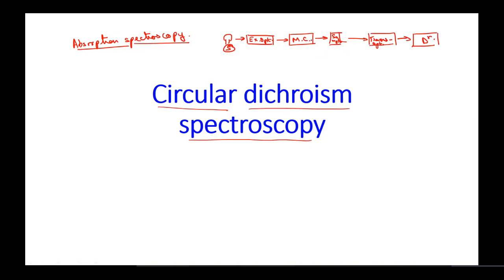Herein, the radiations were being generated by the source. They were then collimated and condensed by the excitation optics.